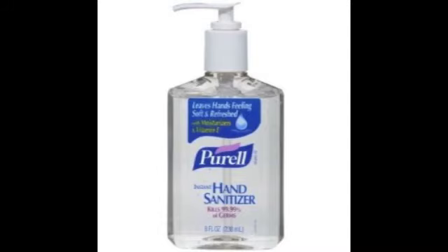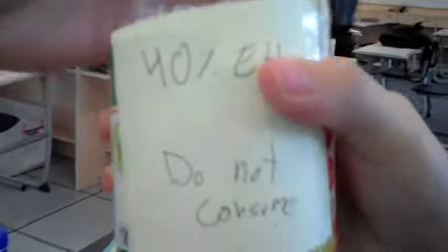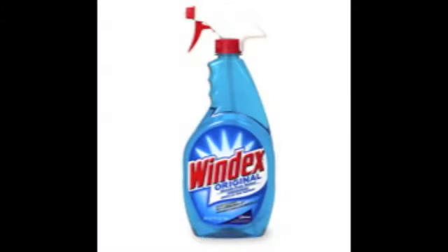100 milliliters Purell hand sanitizer. 150 milliliters of 75% isopropyl alcohol. 100 milliliters 40% ethanol alcohol or drinking alcohol. 100 milliliters of 4% alcohol Windex window cleaner.